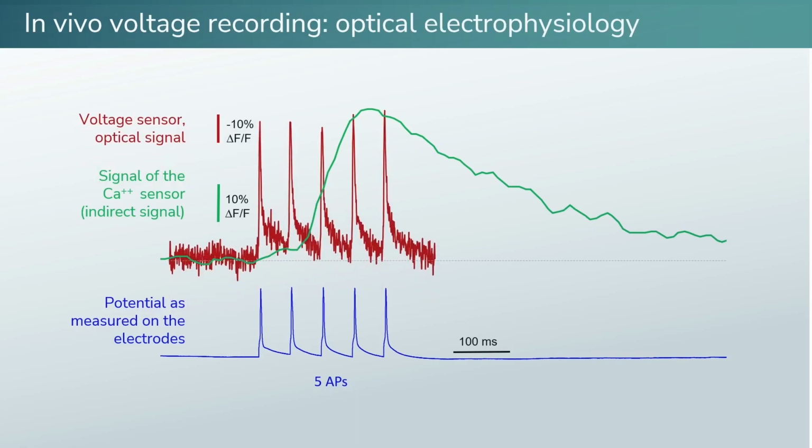Here it is. By recording more than one identifiable cell, like in the former recording, in a genuinely three-dimensional arrangement, one cannot help saying that we are in fact recording optical electrophysiology, therefore opening a whole new avenue for neuroscientific and translational research.